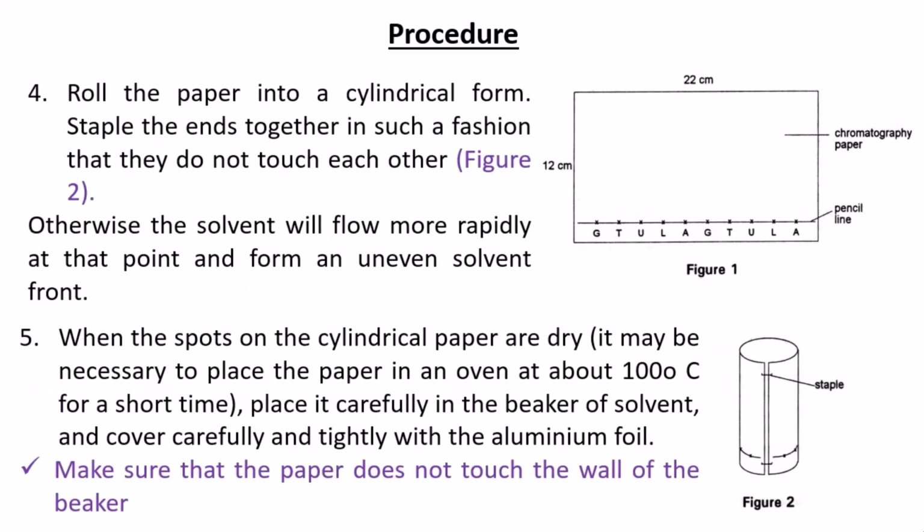So use a capillary tube to do the spotting, just like our thin layer chromatography, except that here our visualization technique wouldn't be the UV lamp or the iodine chamber, but here we're going to use ninhydrin as the visualization reagent. So after developing our paper chromatography spots, we are going to spray the paper with ninhydrin to help us view our spots.